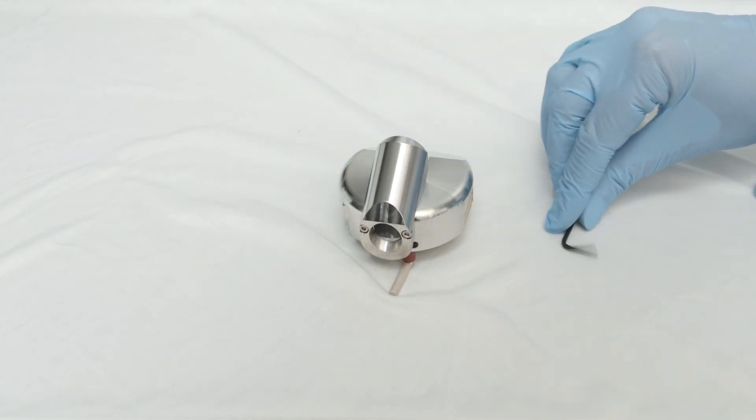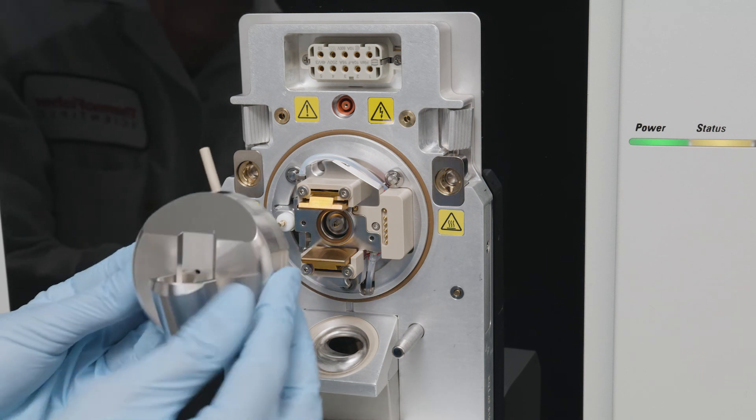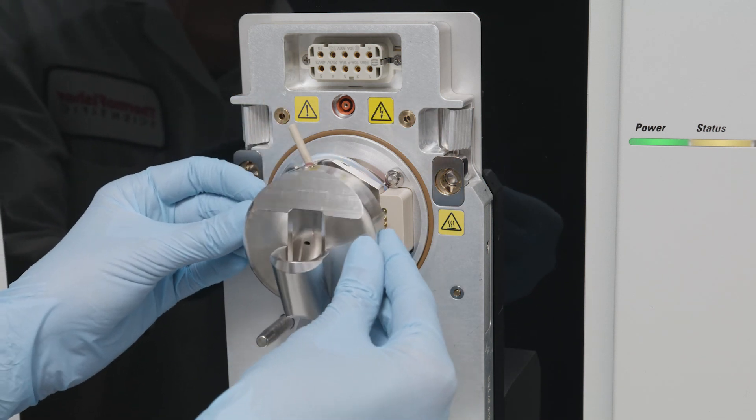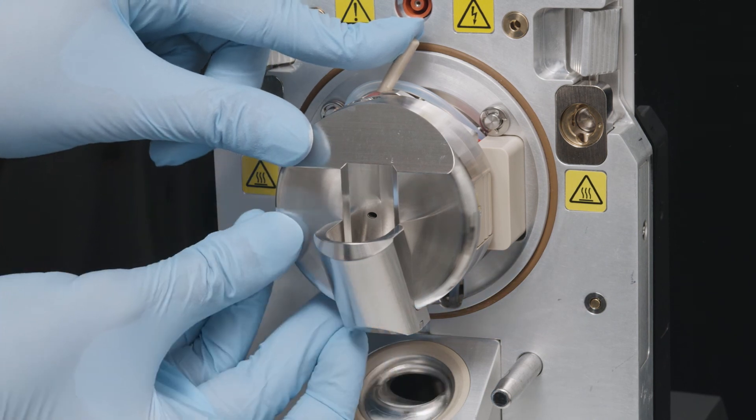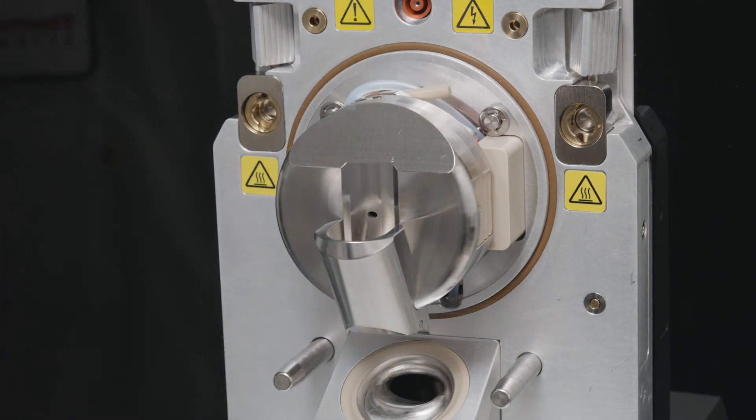Next, place the electrodes back on the FAIMS unit. Remember that a leak check and DV tune need to be performed after reinstalling the electrode assembly. Once they are complete, you are ready to run more samples using FAIMS.